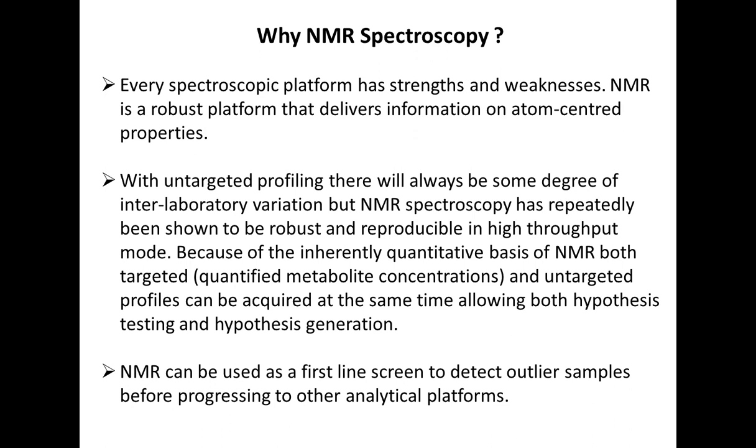Now, if we're thinking of targeted, whereby we model NMR data in a quantitative fashion, then the results between laboratories, which I'll show you a little bit more about later in the talk, are really strongly reproducible, and together the untargeted and targeted approaches allow both hypothesis testing and hypothesis generation in the same experiment.